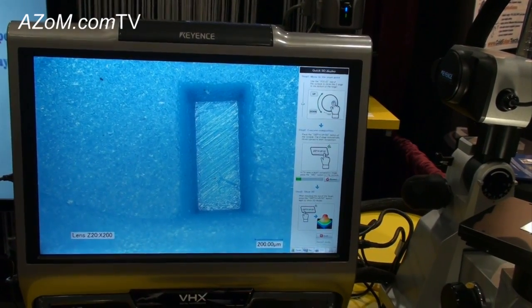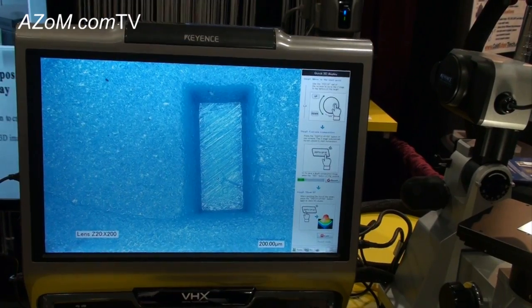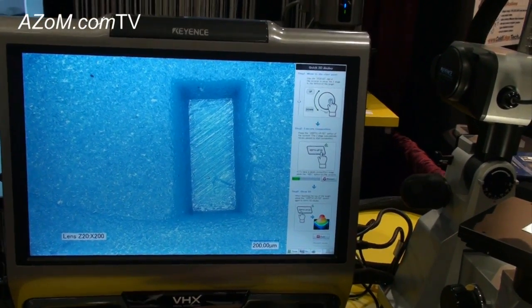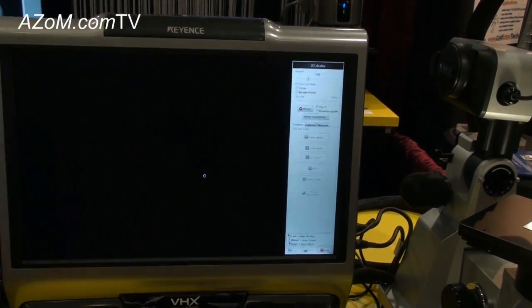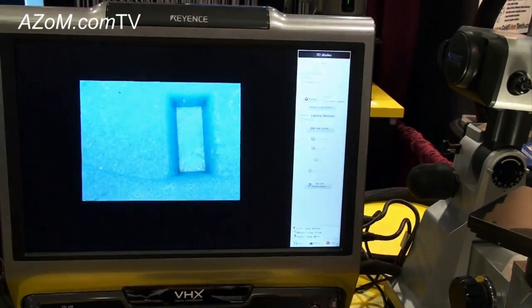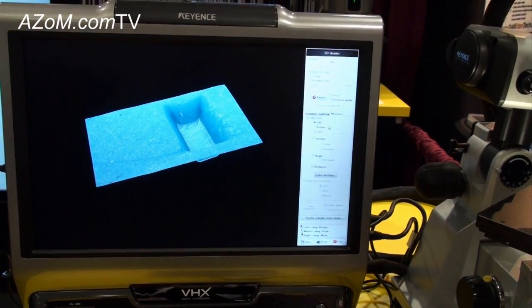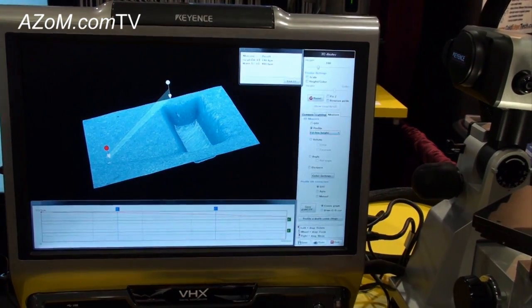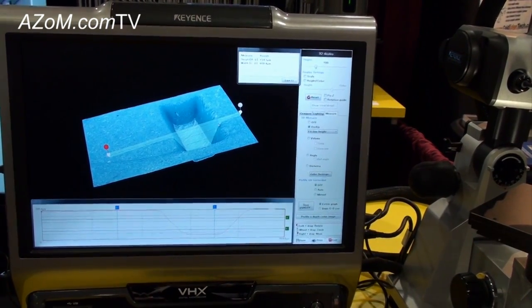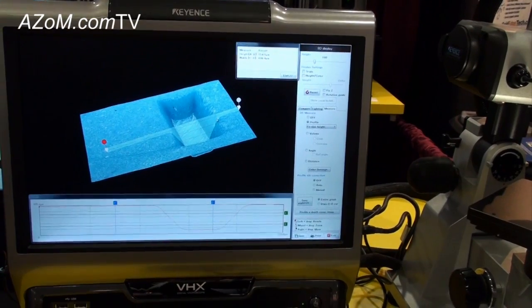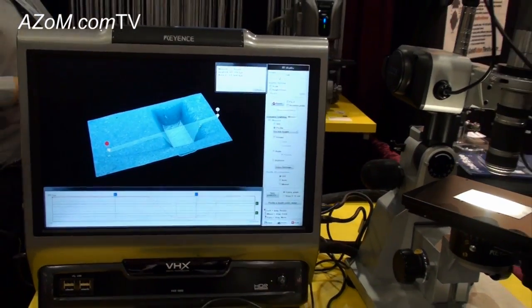You can see the haze disappearing as the pixels come into strong contrast. From here we can click the button one more time to create a model to show the relationship of those planes — we can then quantify and visualize the surface. In this case the depth is about 300 microns, which represents about 15% of the total capability of the device.